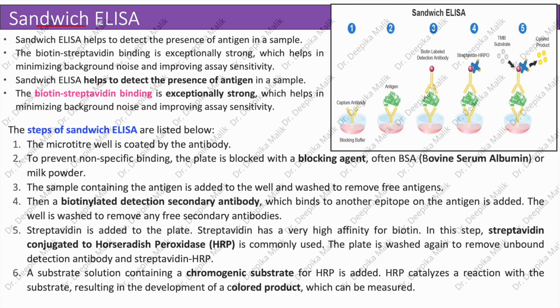Sandwich ELISA. It helps to detect the presence of antigen in a sample. The biotin streptavidin binding is exceptionally strong, which helps in minimizing background noise and improving assay sensitivity.